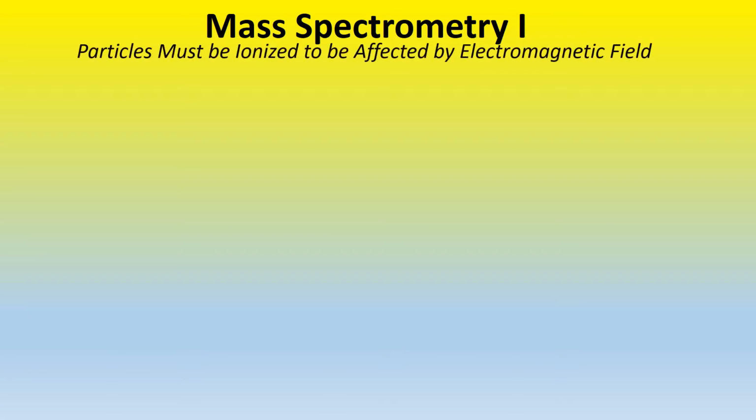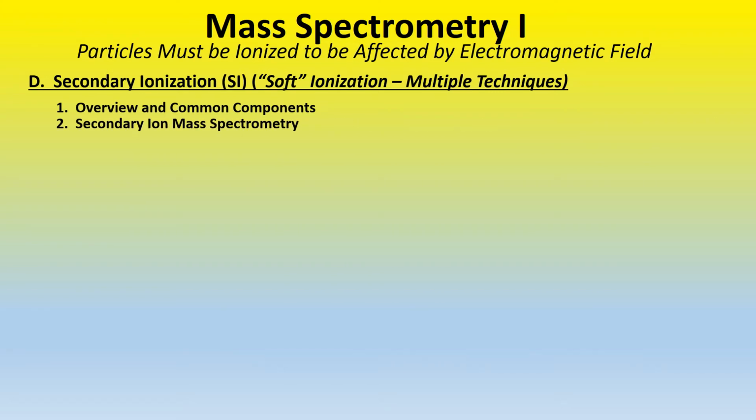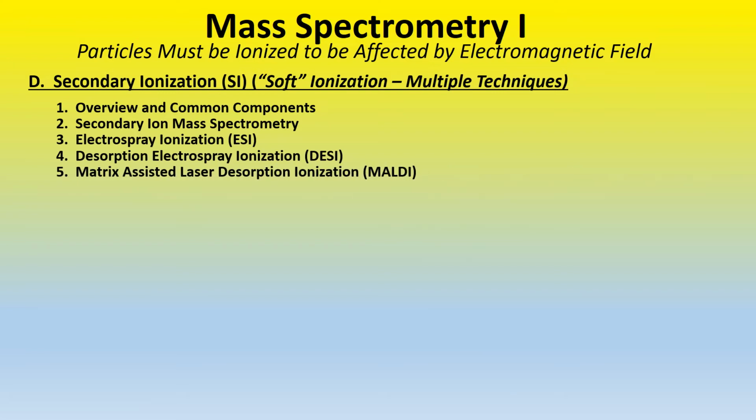Finally, as we look at how to ionize particles and continue looking at variations of secondary ionization, having overviewed the common components, and looked at the more powerful secondary ion mass spectroscopy, your basic electrospray ionization, and DESI, the most modern and latest method is called matrix-assisted laser desorption ionization, or MALDI.